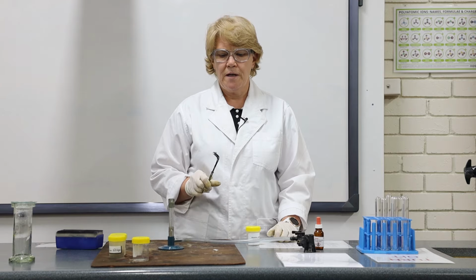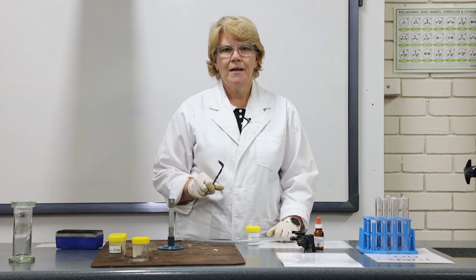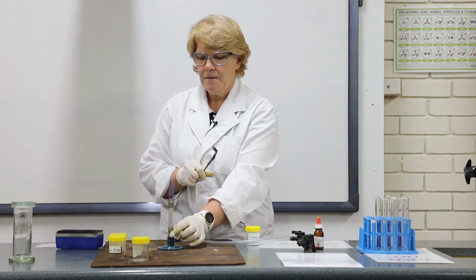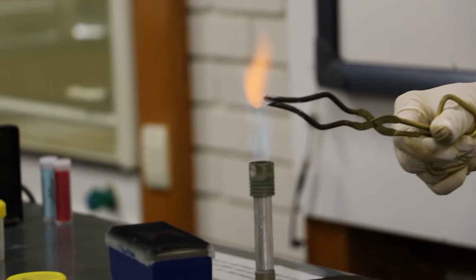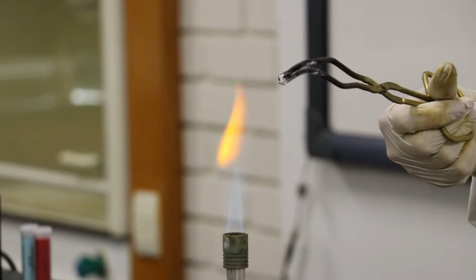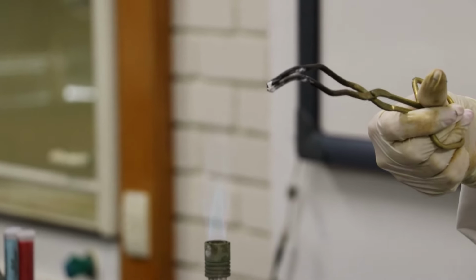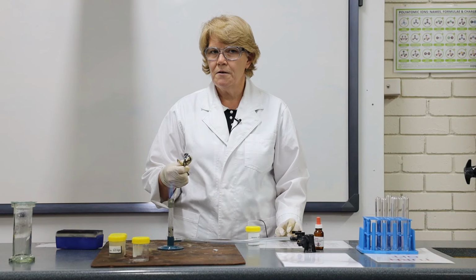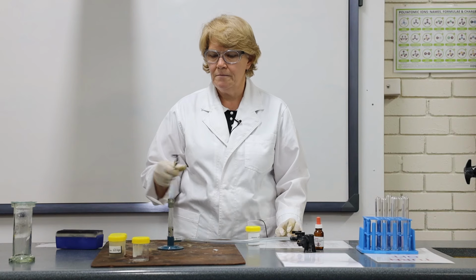Let's look at the reaction between aluminium and oxygen. I have a piece of aluminium. It's a shiny grey colour. Can you see how shiny it is? Let's put it into the Bunsen burner flame. We can see immediately that it is melting in the Bunsen burner flame. Just going to try and heat it as much as I can.